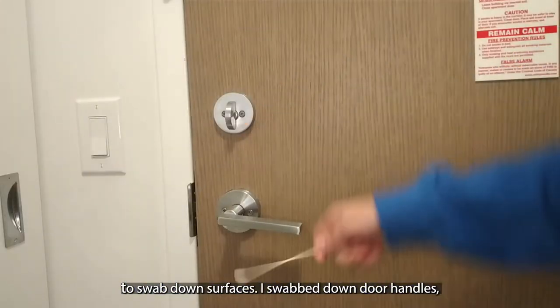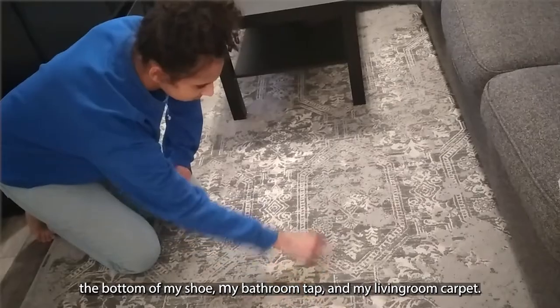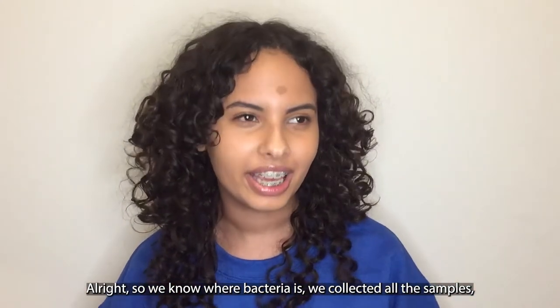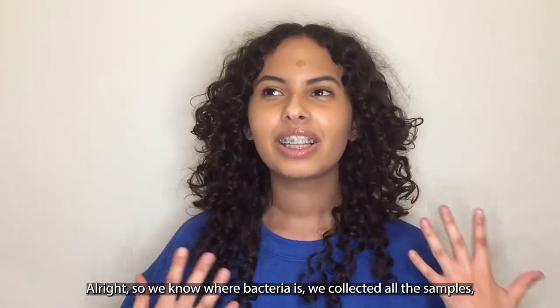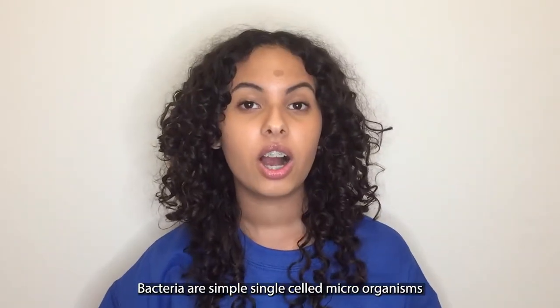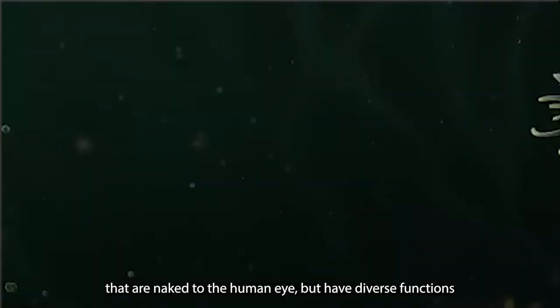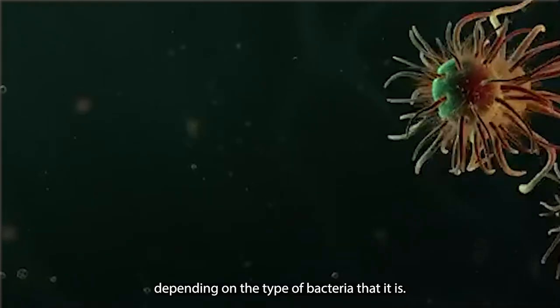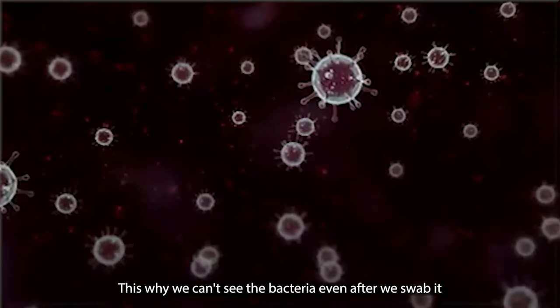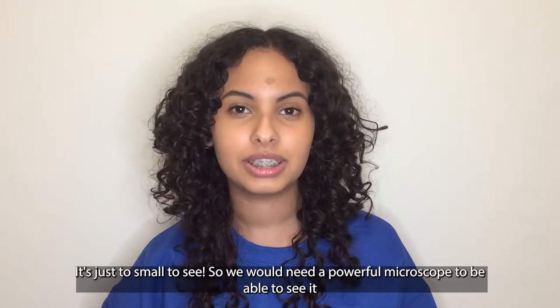I swabbed down door handles, the bottom of my shoe, my bathroom tap, and my living room carpet. So we know where bacteria is and we've collected all the samples. But what is bacteria? Bacteria are simple single-celled microorganisms that are invisible to the human eye, but have diverse functions depending on the type. This is why we can't see the bacteria even after we swab it — it's just too small to see, so we would need a powerful microscope to be able to see it.